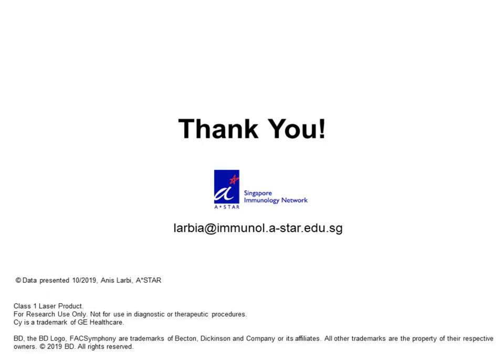Thank you. Second question: is the drop-in cheat sheet based on the properties, primarily brightness, of each fluorochrome?